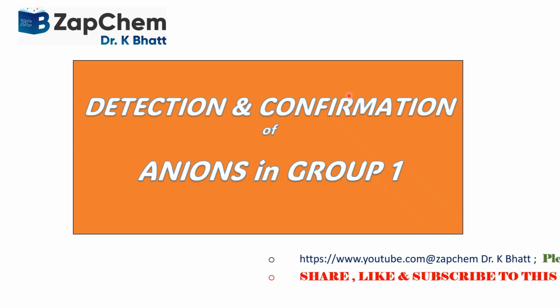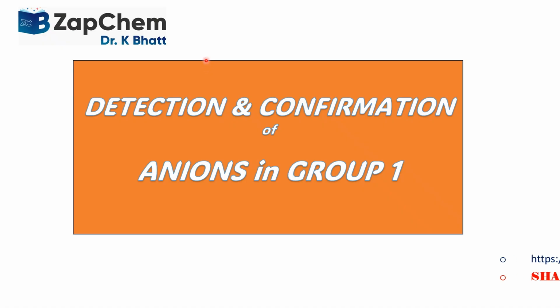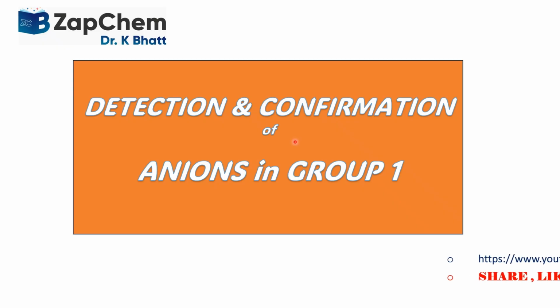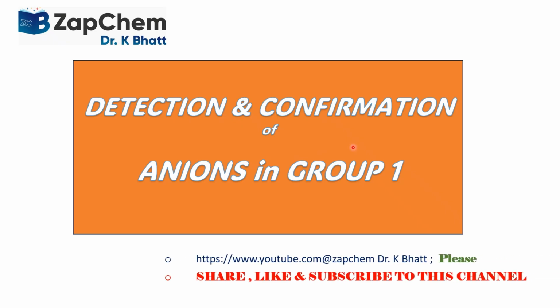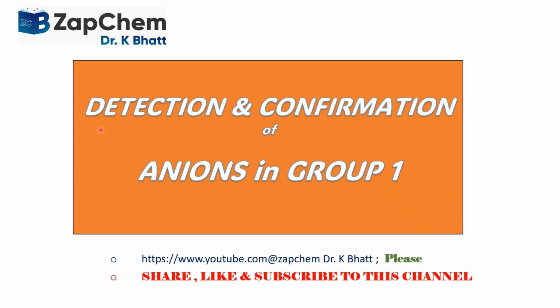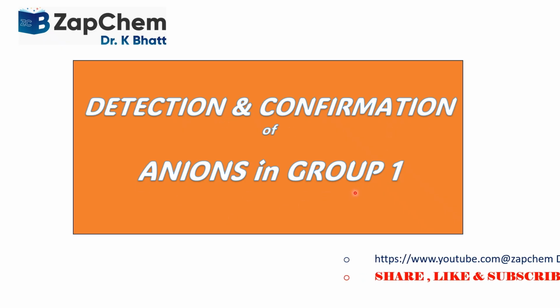I wish to make you recall the practical chemistry where we discussed in our earlier video how anions are grouped. A little attention will make you recall that anions are grouped into three groups or three classes: group 1, group 2 and group 3. Today we shall take up the methods and procedure for detecting and confirming anions in group 1.